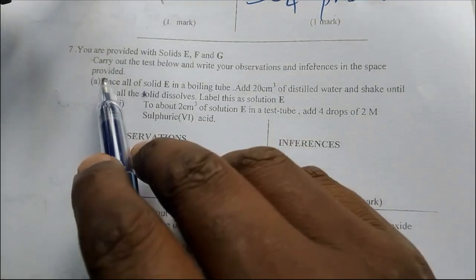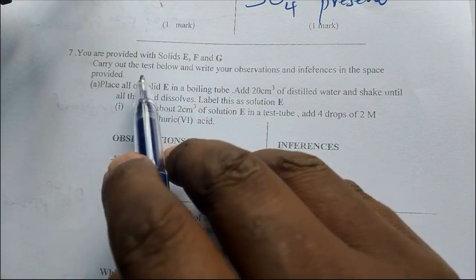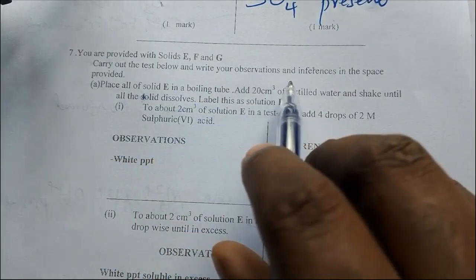You are provided with solid EFG, carry out the test below and write your observations and inferences in spaces provided.